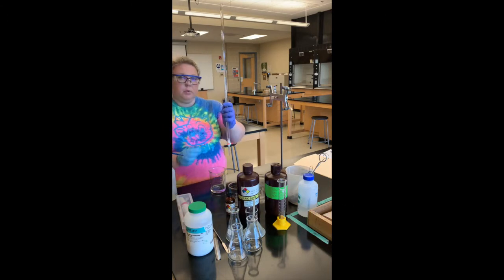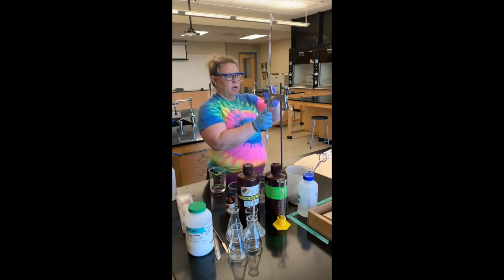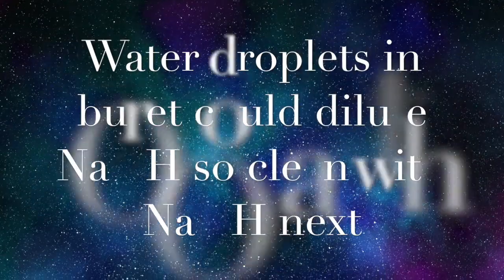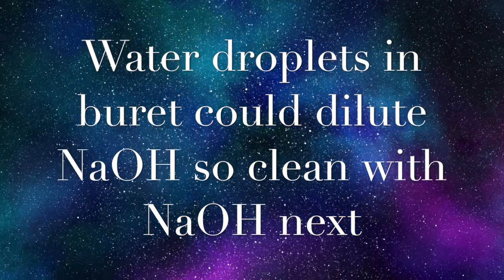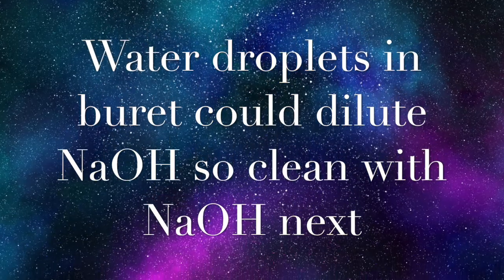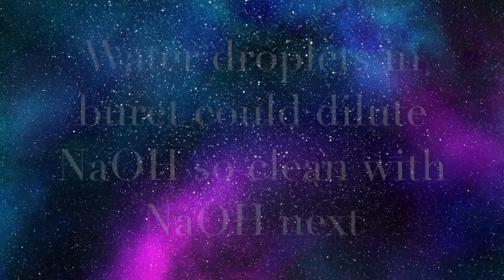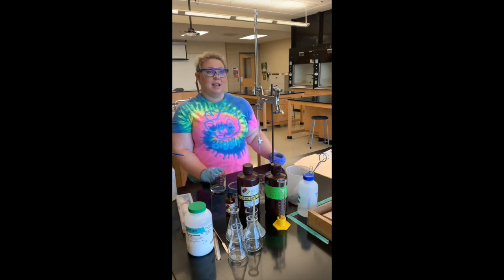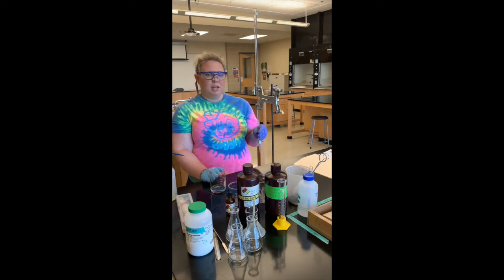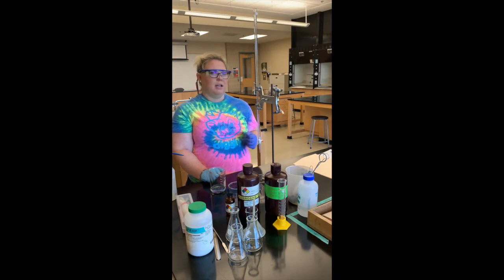Our burette has been washed with distilled water. Now what's in the burette is some water residue. If we have water in here, it could dilute our sodium hydroxide. Since you're doing several different trials, you want to make sure all of the sodium hydroxide has the same concentration. So we want to rinse out any water that might be stuck in here by doing the washing with sodium hydroxide next.